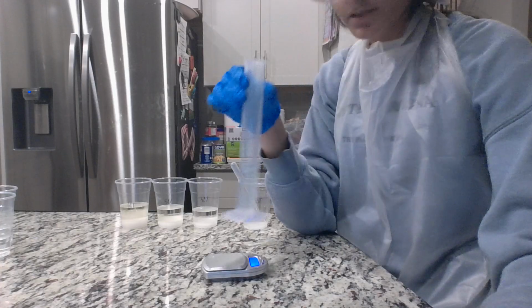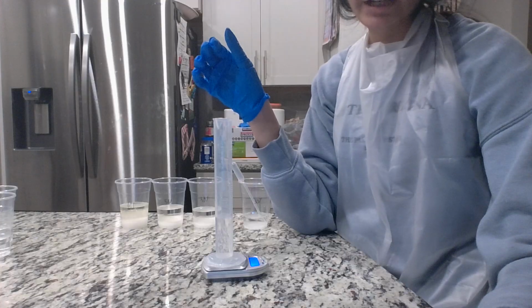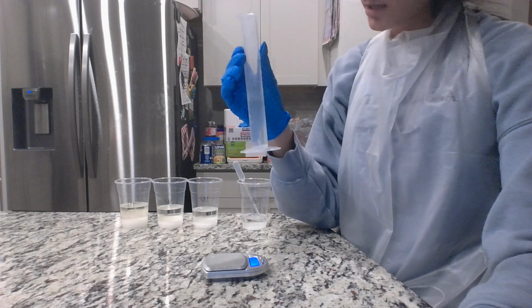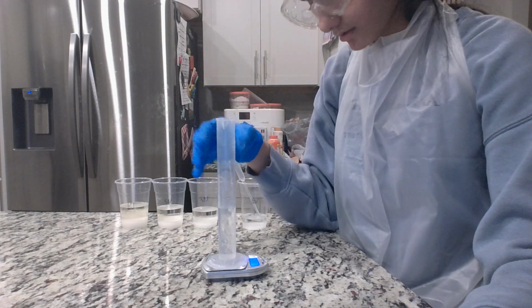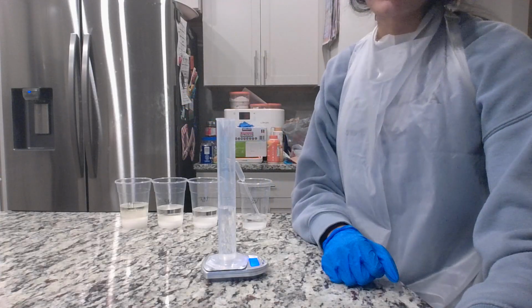This is now 20 milliliters of solution, which weighs about 51.76 grams. Now this is 25 milliliters, which weighs about 57.65 grams.